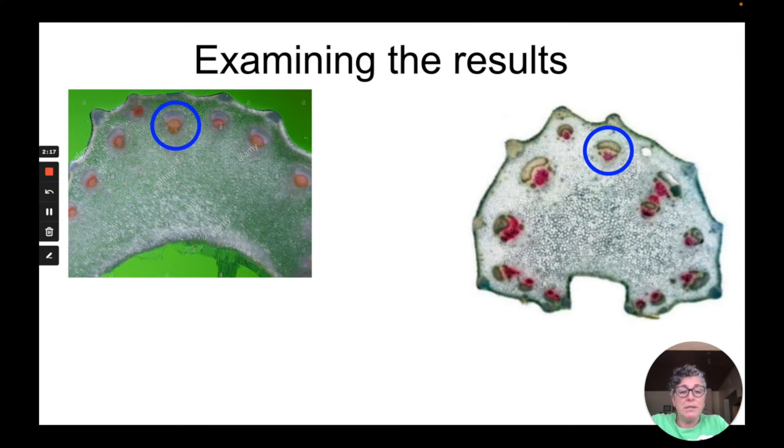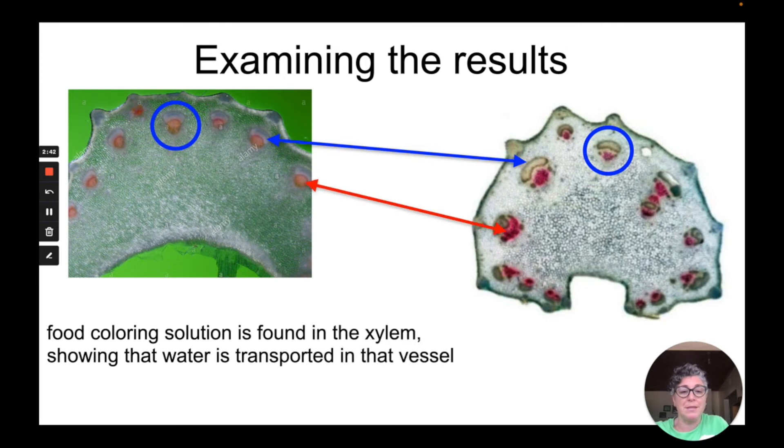We know that the vascular bundle in the stem contains xylem and phloem. Remember the phloem is towards the epidermal layer and the xylem is towards the center portion of the stem. We can see that the phloem does not have any dye in it whereas the xylem does. The food coloring solution is found in the xylem, showing that water is transported in that vessel.